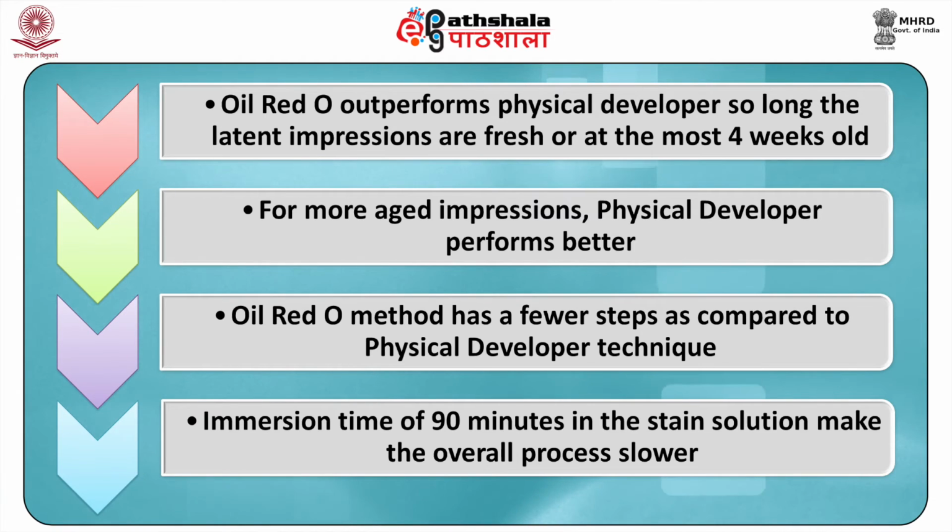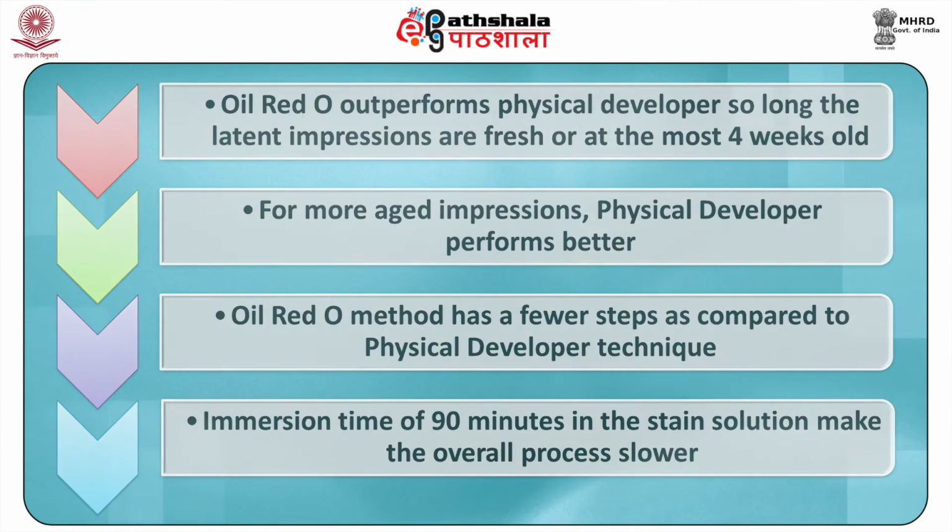No doubt, oil red O method has fewer steps as compared to physical developer technique. Yet, the immersion time of 90 minutes in the stain solution makes the overall process slower.